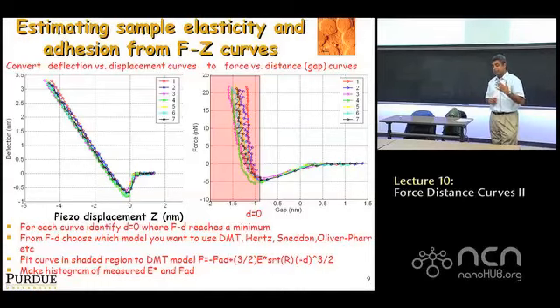There are other ways. You can, for example, scan gratings of known sizes and try to back out what the tip radius is using tip deconvolution software called SPIP. We'll talk about these things later in the class, but all those things are possible. Perhaps the easiest non-destructive way is to take high-resolution SEM images in two orthogonal planes and try to fit, as best as you can, an appropriate tip radius to the tip.